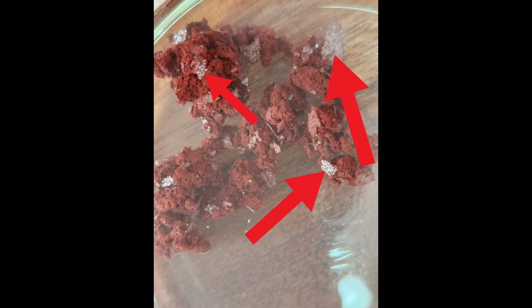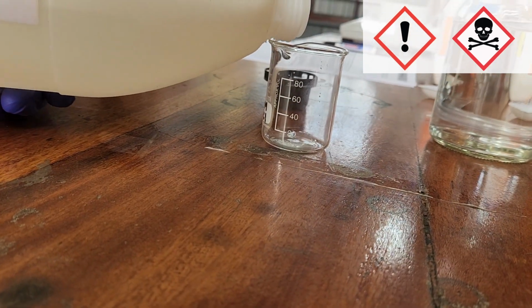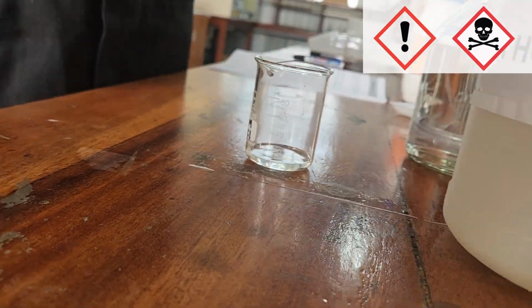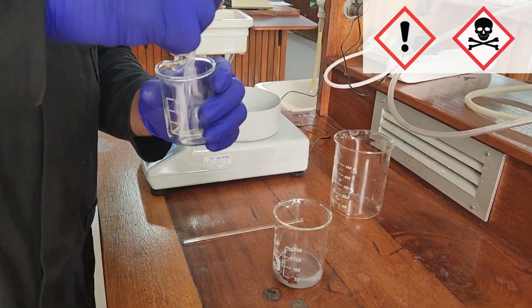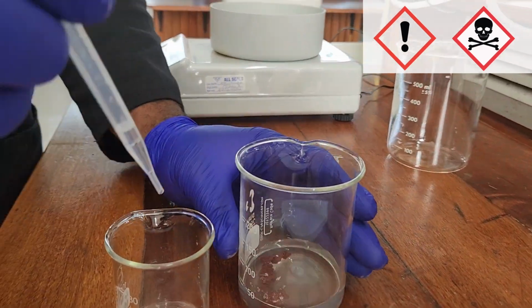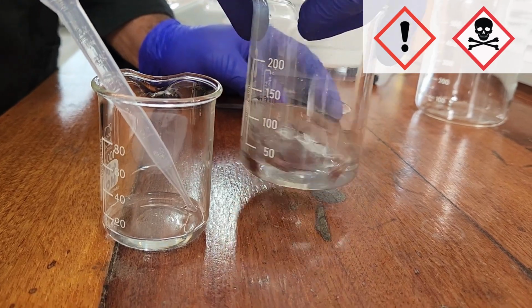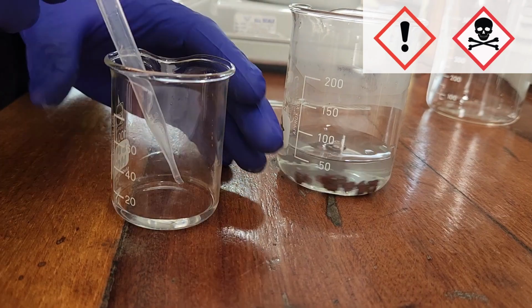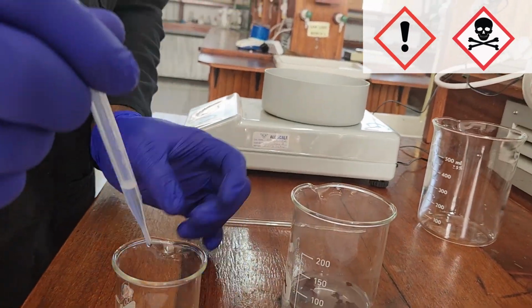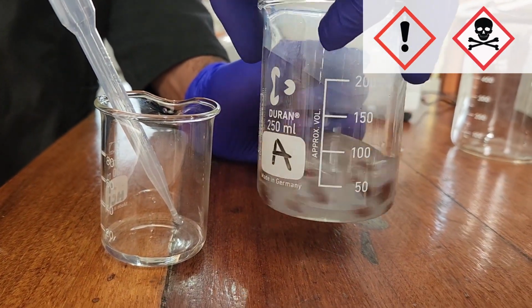If there is excess aluminium foil still observed in any of the beakers after 30 minutes, then add 6 molar hydrochloric acid. Hydrochloric acid is corrosive, so handle this with care. Add the hydrochloric acid in approximately 1 cubic centimeter portions and stir with your glass rod or swivel the beaker after each 1 cubic centimeter addition until all of the aluminium foil is completely reacted and no longer visible. Do not add more than 5 cubic centimeters to each beaker in total.